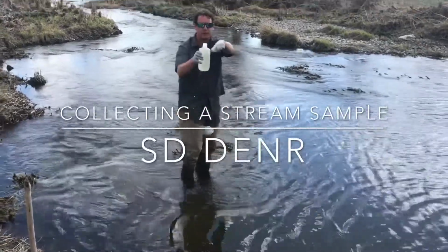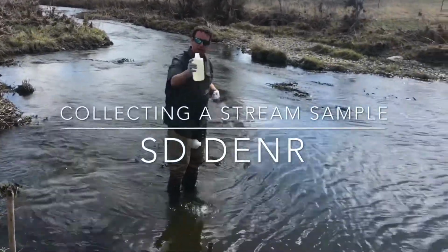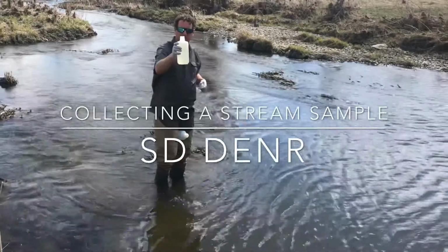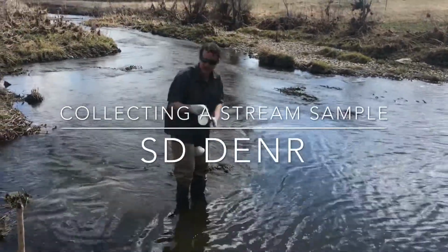You want to fill it up to the shoulder, so I got a little too much in there, so we just dump a little bit out until it's just up to the shoulder, and then we put the lid on. That's one of them. Now we'll do the other one.